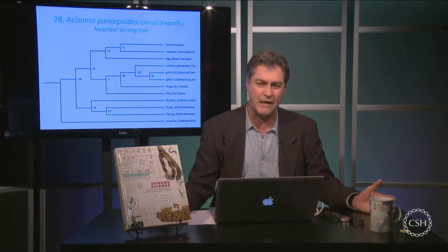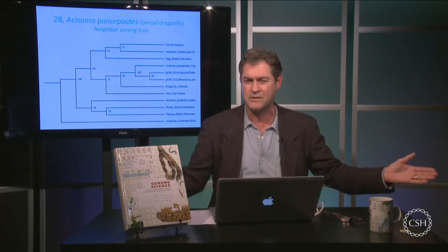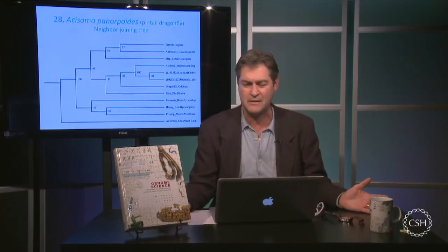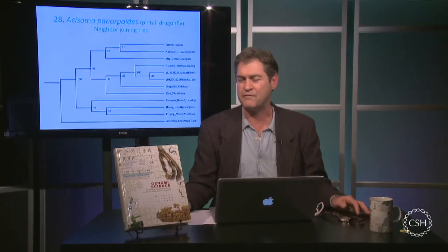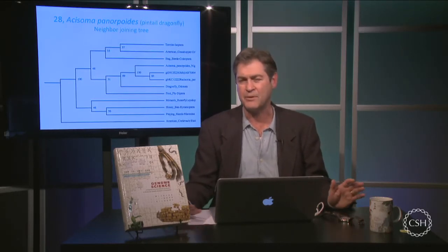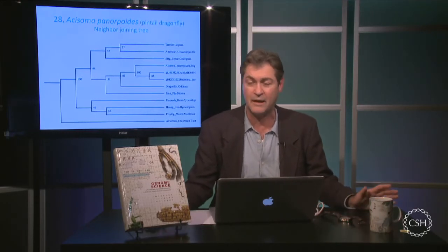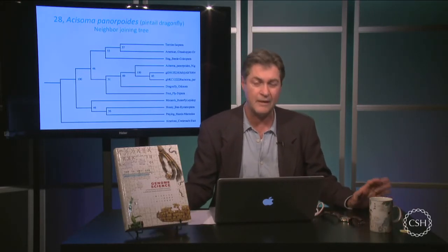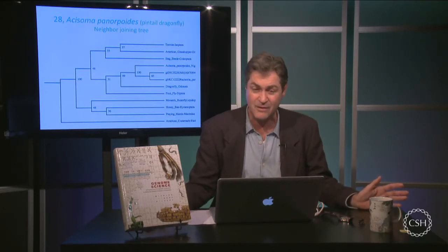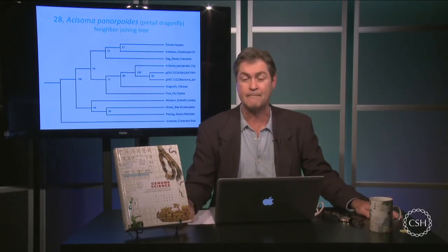Because in fact what we're finding is a lot of times when people thought the same organism was the same across a big range, sometimes there's what's called a cryptic species there, another species that's sitting there, and you can differentiate them sometimes by behavior or other things, but you can differentiate them by sequence. So I'm left with this conundrum. I don't know anything about dragonflies. I learned a bit. It's very interesting. Also, some dragonfly species migrate thousands of miles like birds. So that's probably how this one got around.